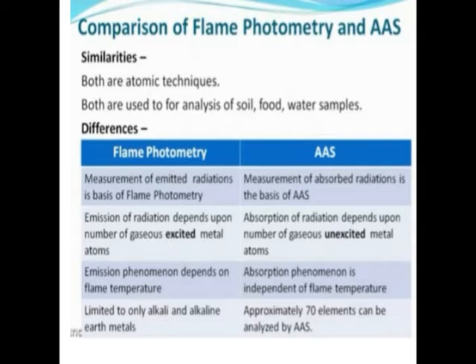What are the similarities? Both are atomic techniques, so we have to convert the sample into ground state gaseous atoms. Second, both are utilized for elemental analysis. Third, they can be utilized for the analysis of soil, food, and water samples.